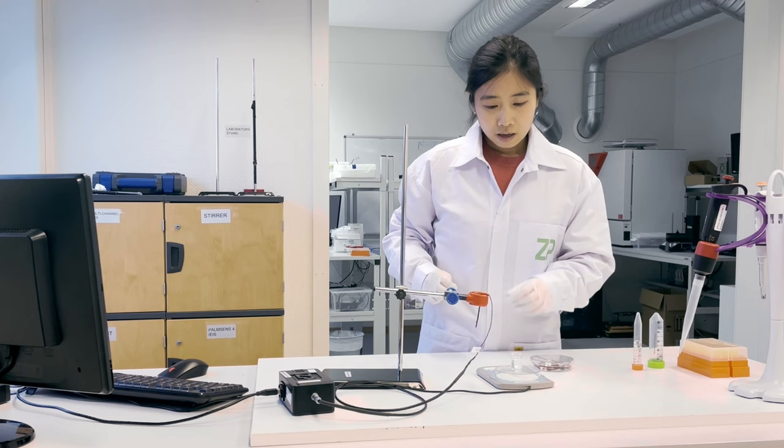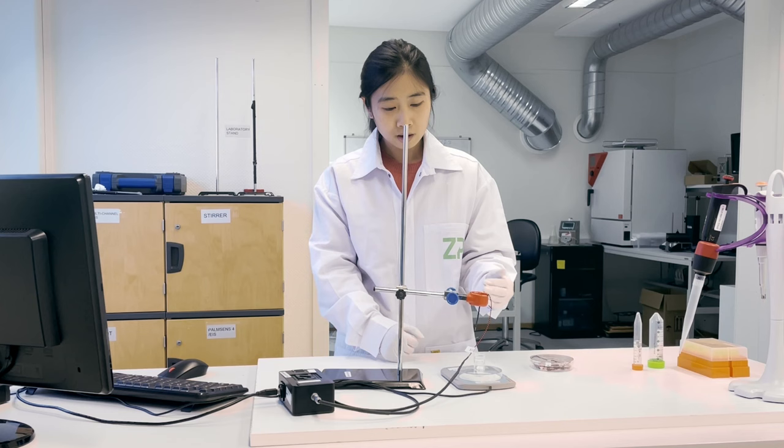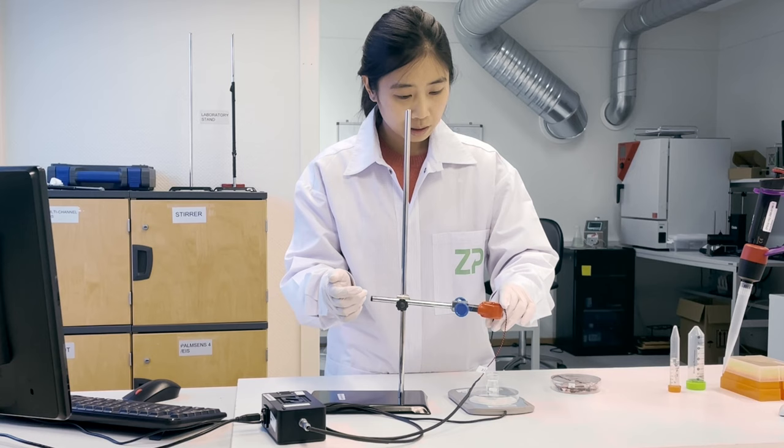And now we need to turn on the magnetic stirrer. Make sure the magnetic stirrer bar is in the middle of the solution so that it has a lower chance to be hitting the wall to cause some electronic noise.